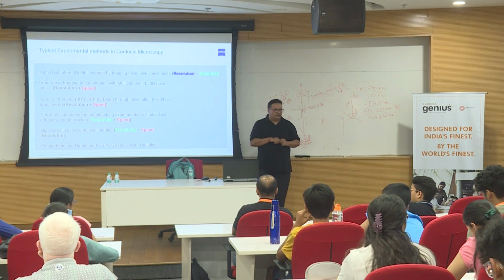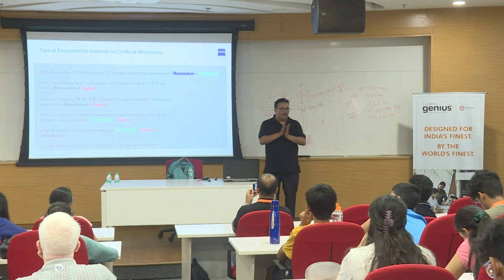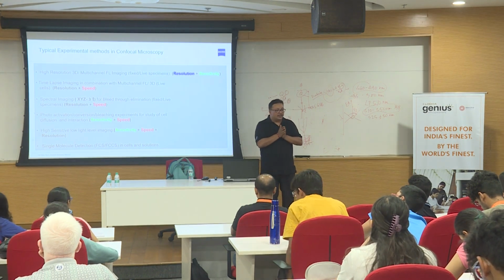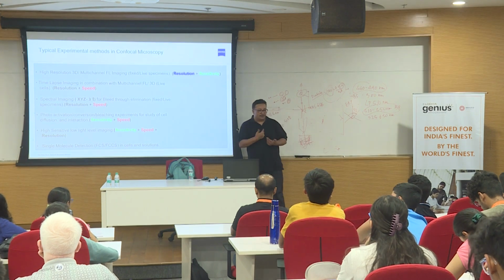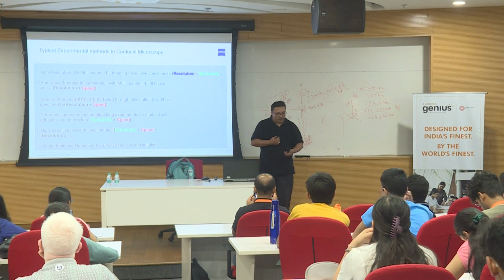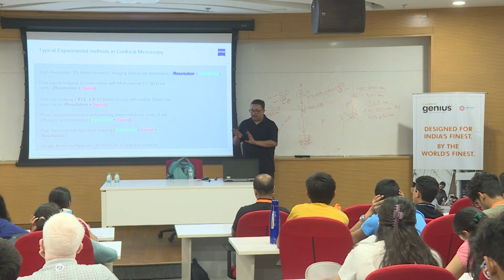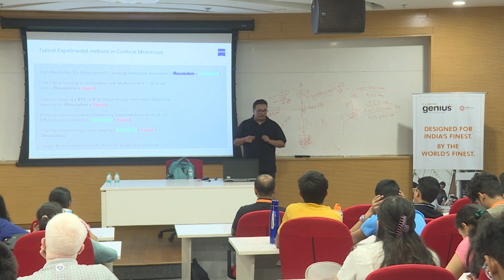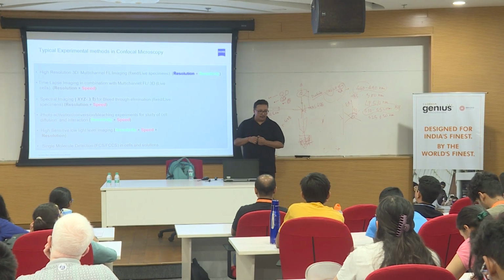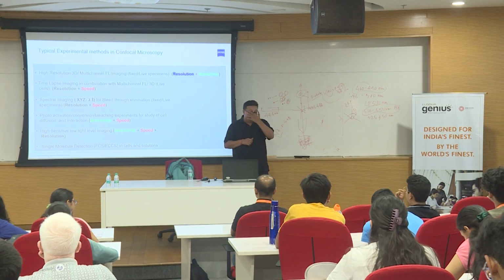So the idea is to detect the faintest information; I need to have a highly sensitive system, a highly sensitive detector, a highly sensitive confocal. And when I say a highly sensitive detector or system, it means the minimal amount of signal that can be acquired or captured without the background or without the noise. Simple. Whether it is a camera or your eyes, when I say that my eyes are more sensitive than yours, what does it mean? Does it mean that I can look much finer, much cleaner, much more?